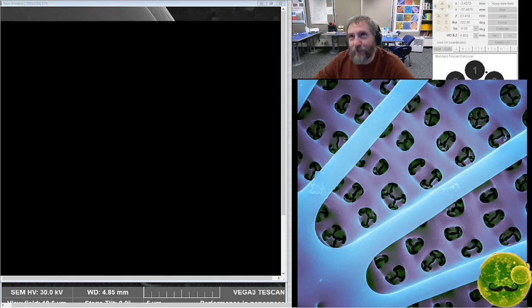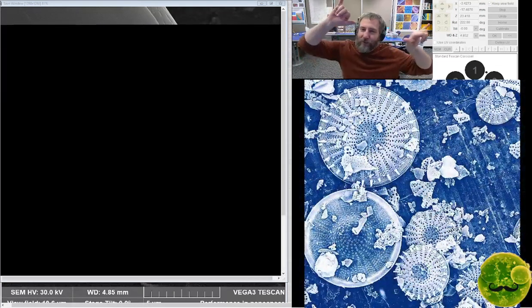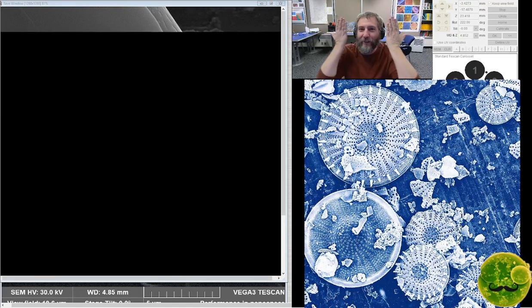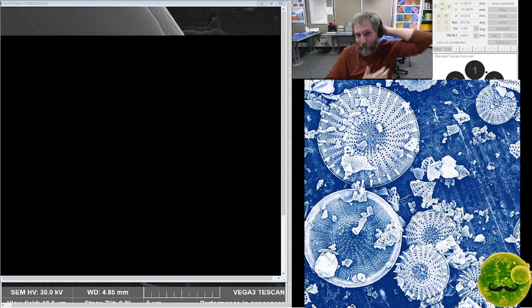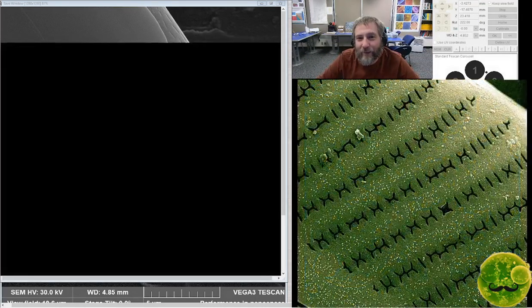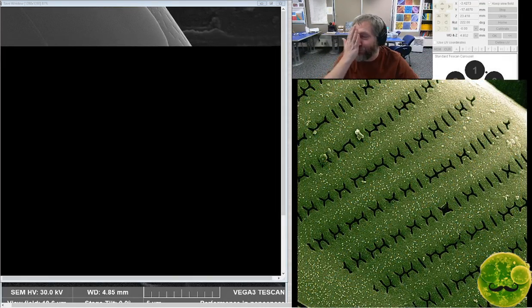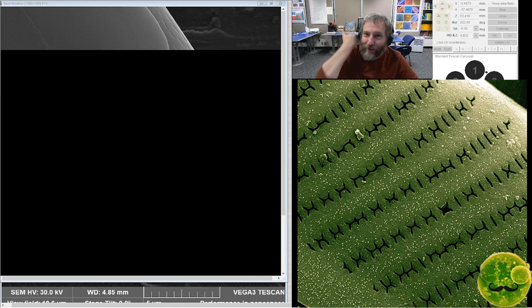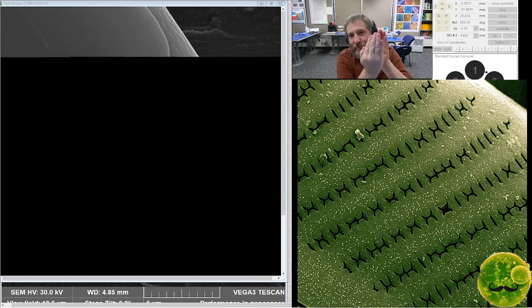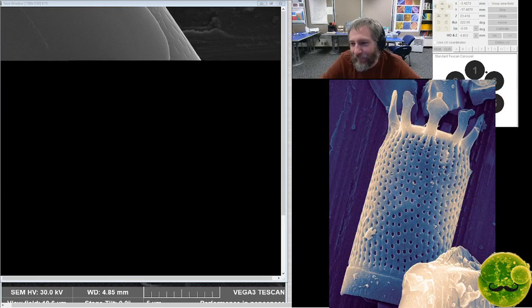They only look like devil horns because you're looking at them from the side. So like if you had your face and then like a Janus, you know, there was a second face on the back of your head and you each had a horn, then like if it was a unicorn that had a head facing this way and another head facing that way, because that's the way diatoms are shaped. There's like a face pointing off of both sides.